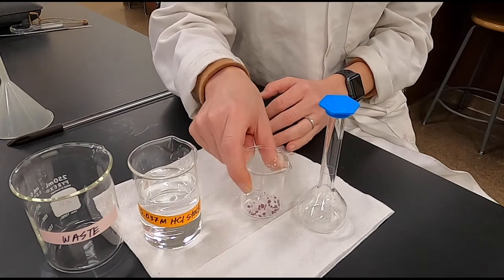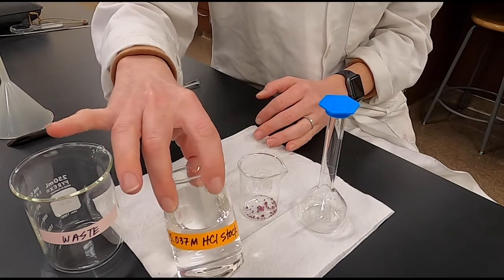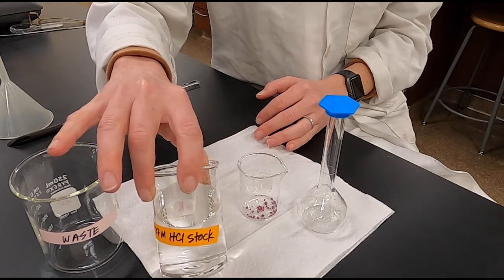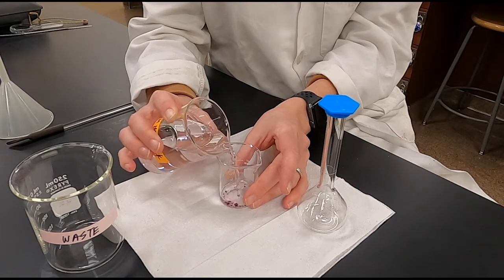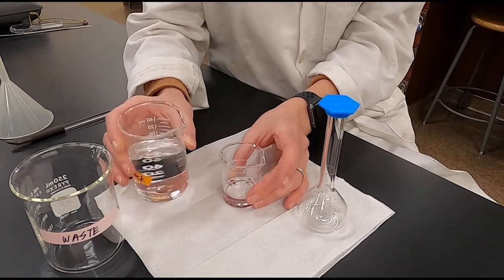To prepare our solution, we're going to add approximately 20 milliliters of our hydrochloric acid stock solution. This is just to dissolve it so that it'll make it easier for us to transfer it to the volumetric flask.